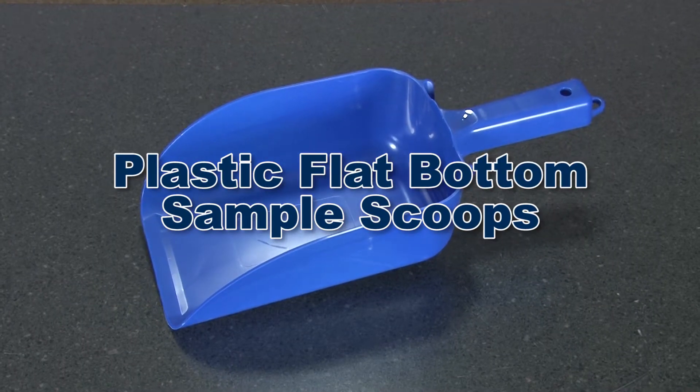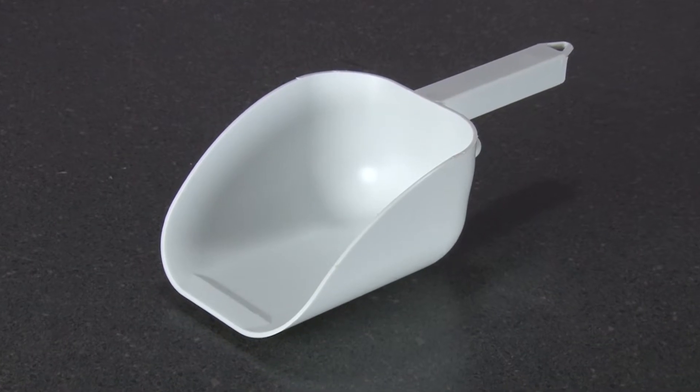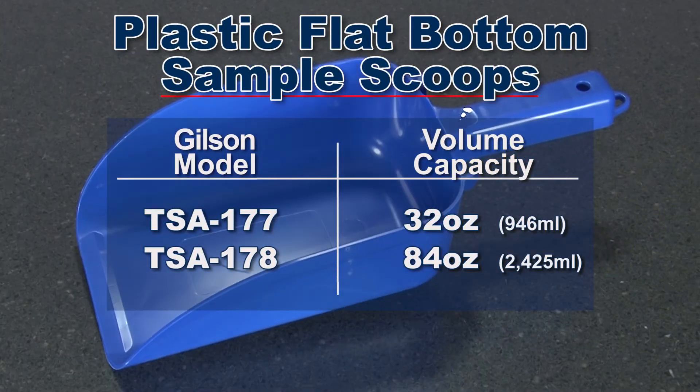Gilson's plastic flat bottom scoops are constructed of sturdy high-impact brake-resistant polystyrene and have a rigid non-slip hand grip. Gilson offers plastic flat bottom sample scoops in 2 different volume capacities.